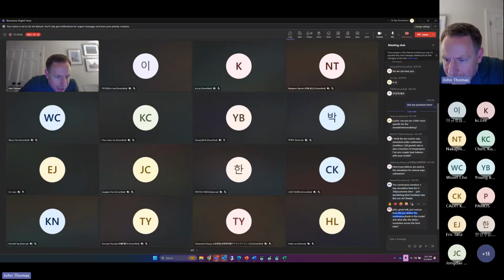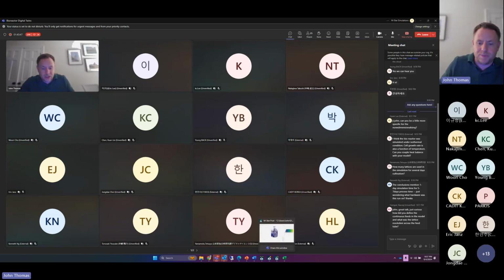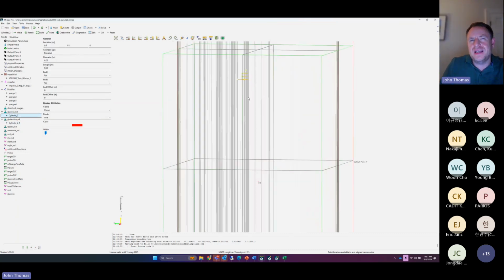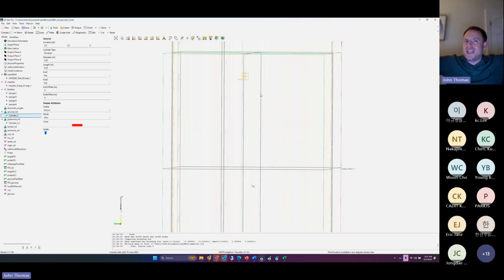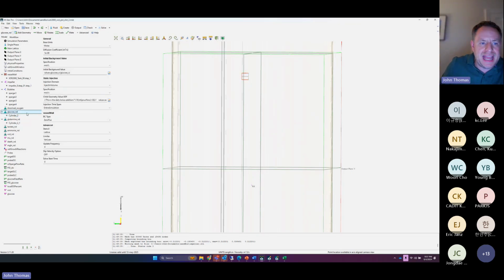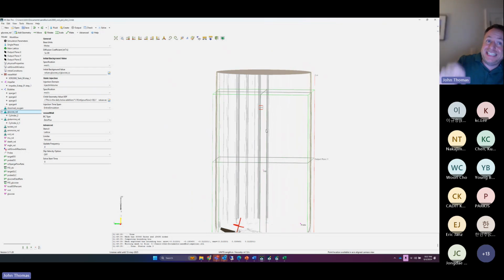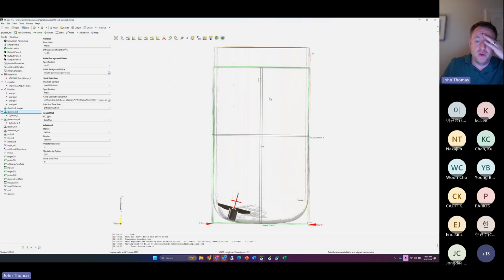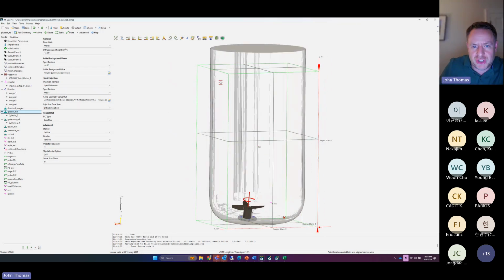Thank you, Navraj. How do you define the model? Okay, great question. In this case, when I'm adding glucose and glutamine, I have a cylinder representing the bolus addition. So I didn't model the inlet explicitly. I instead defined a feed boundary condition that's leading to the addition of glucose and glutamine in that region of the cell. One thing I did not include in this model was a free surface and volume changes. We can do that. That's not a problem. But for simplicity and validation, I assumed that we had a fixed volume, which led to this kind of just source addition.